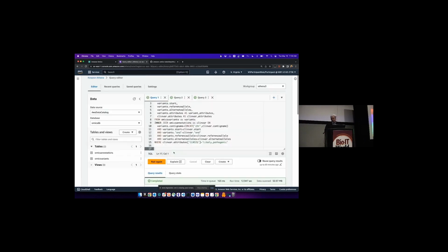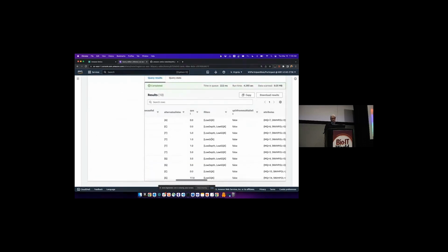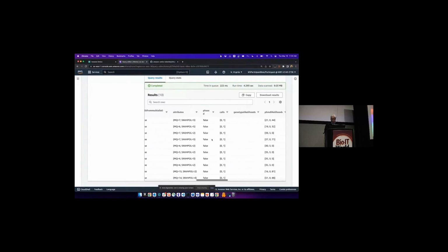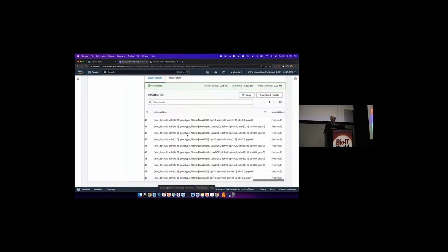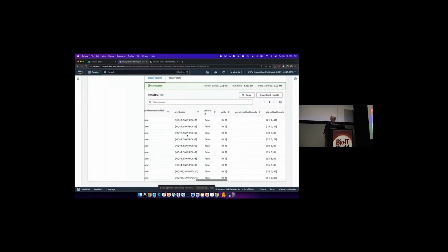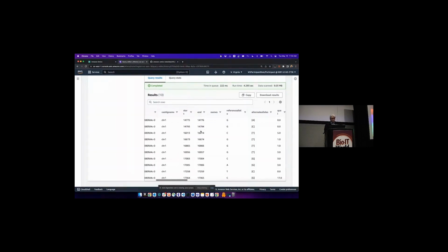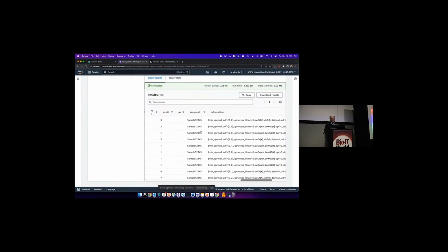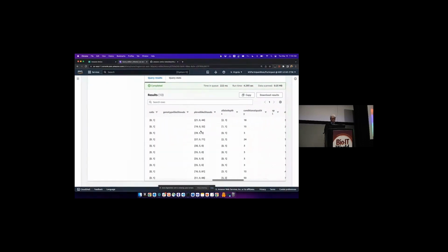Oh yeah, so those are all columns that are there. They might be in the deeper structure within the output. So yeah, keep scrolling. You might not see it in this one, but they're in other VCF files that we have. They'll come through. You'll see like all of the annotation, or there's tags in a VCF file that they will get processed out and put into either the information column or the attribute column, somewhere in here.